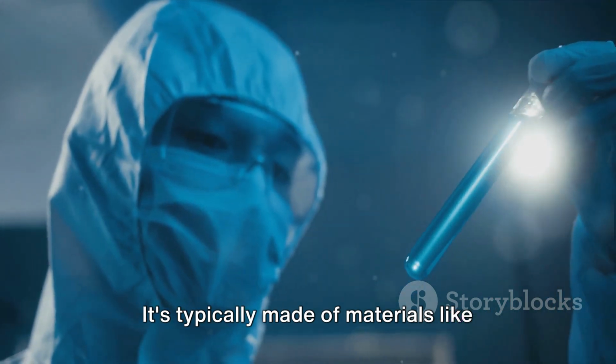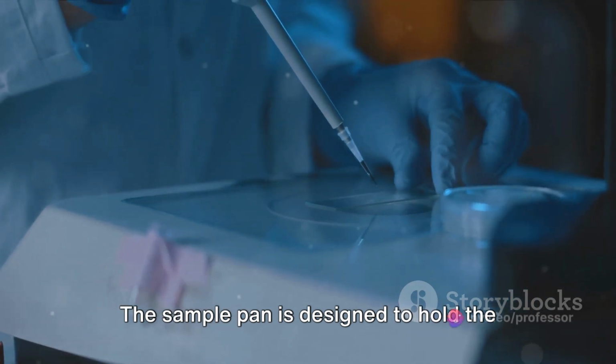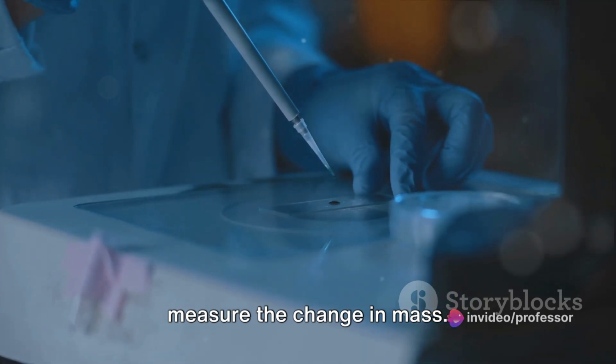It's typically made of materials like platinum or alumina that can withstand the high temperatures of the furnace. The sample pan is designed to hold the sample in place while it's being heated, ensuring that the balance can accurately measure the change in mass.